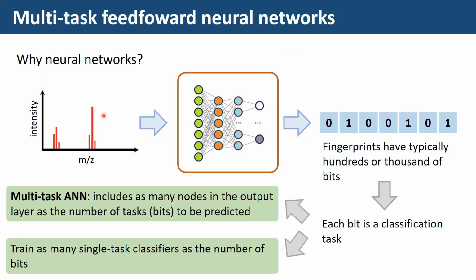So we decided to go for artificial neural networks, which was something really new for us. So we also had to decide how to judge our model, which kind of figures of merit you need to evaluate this kind of model where you predict a fingerprint.